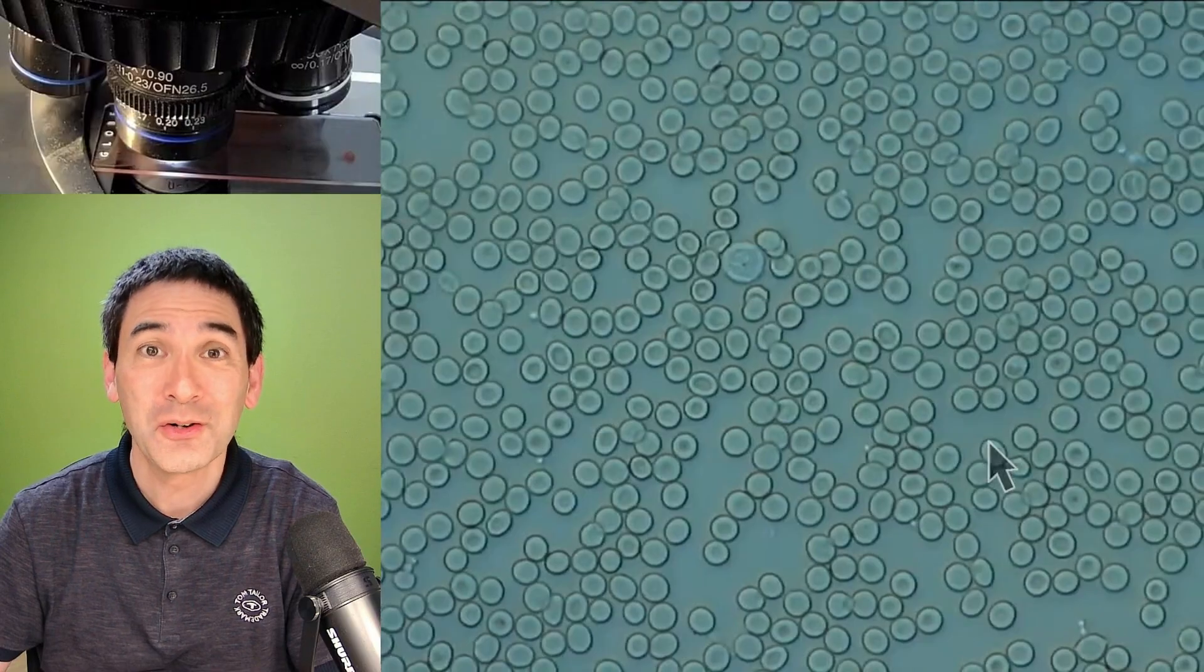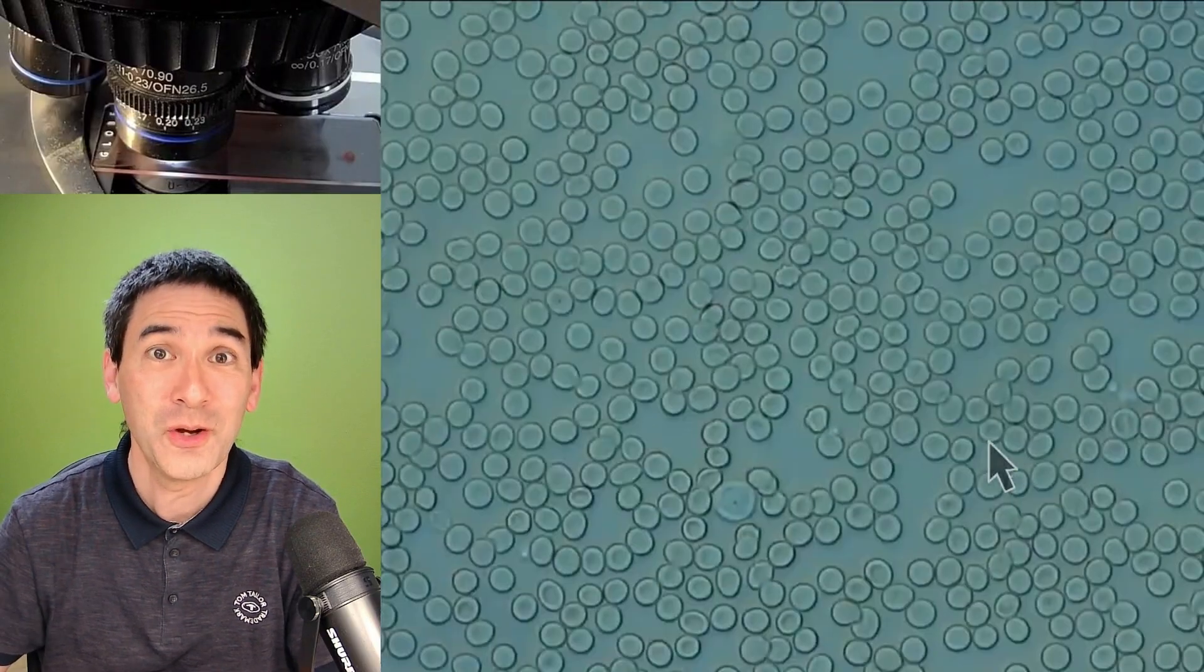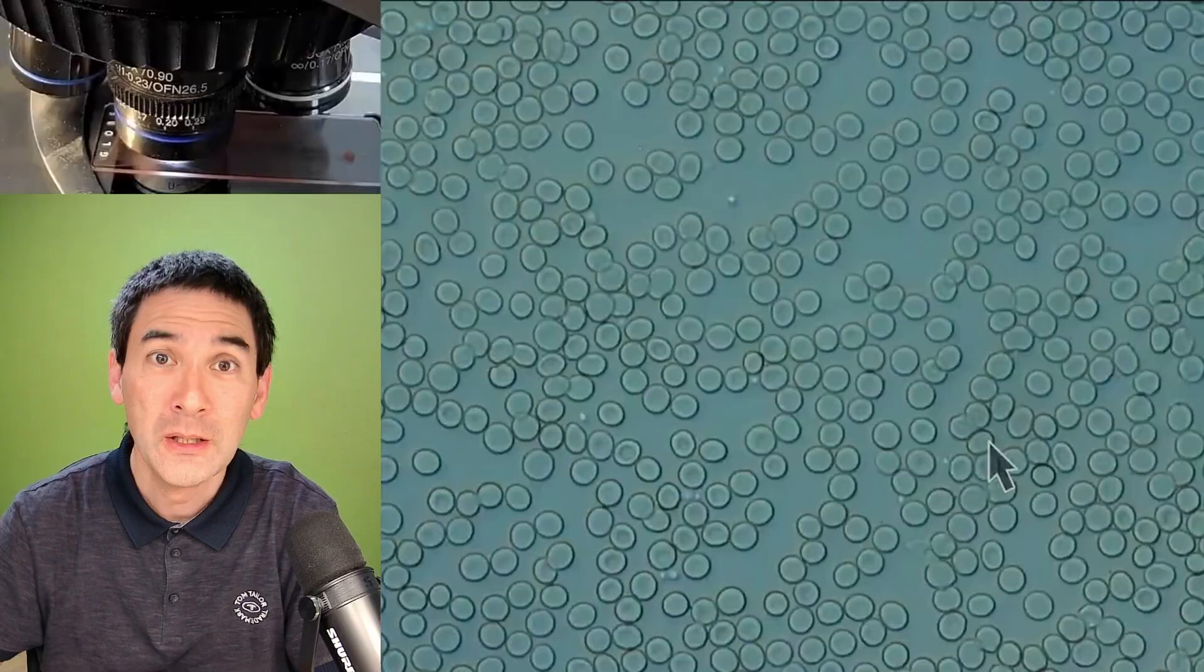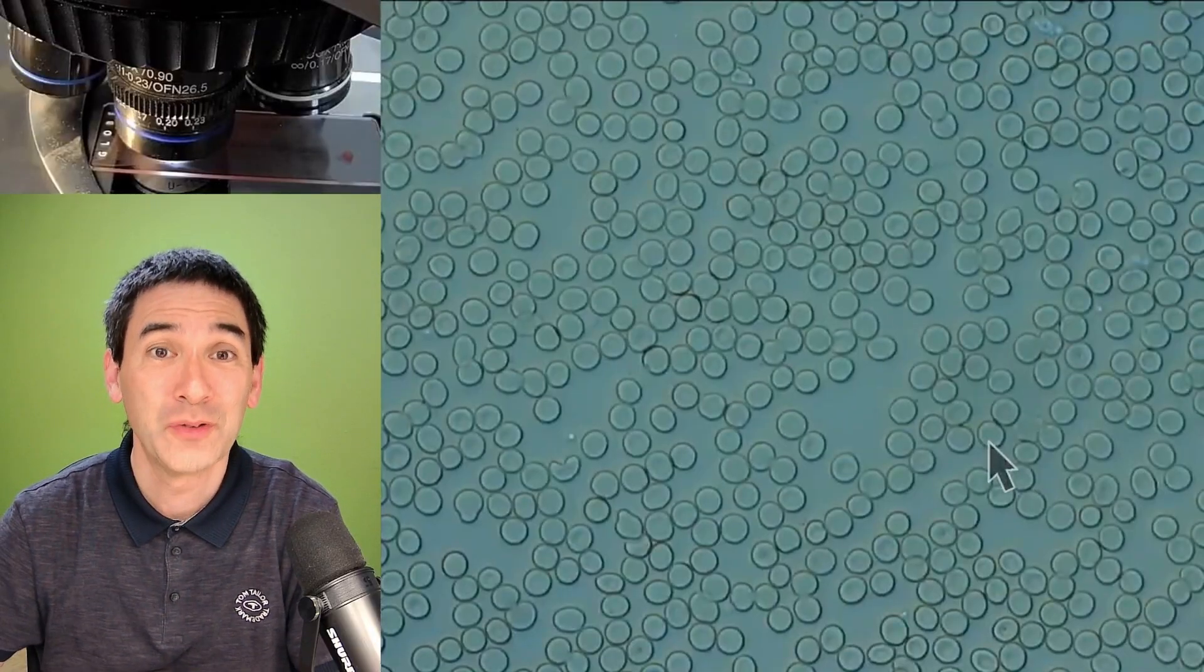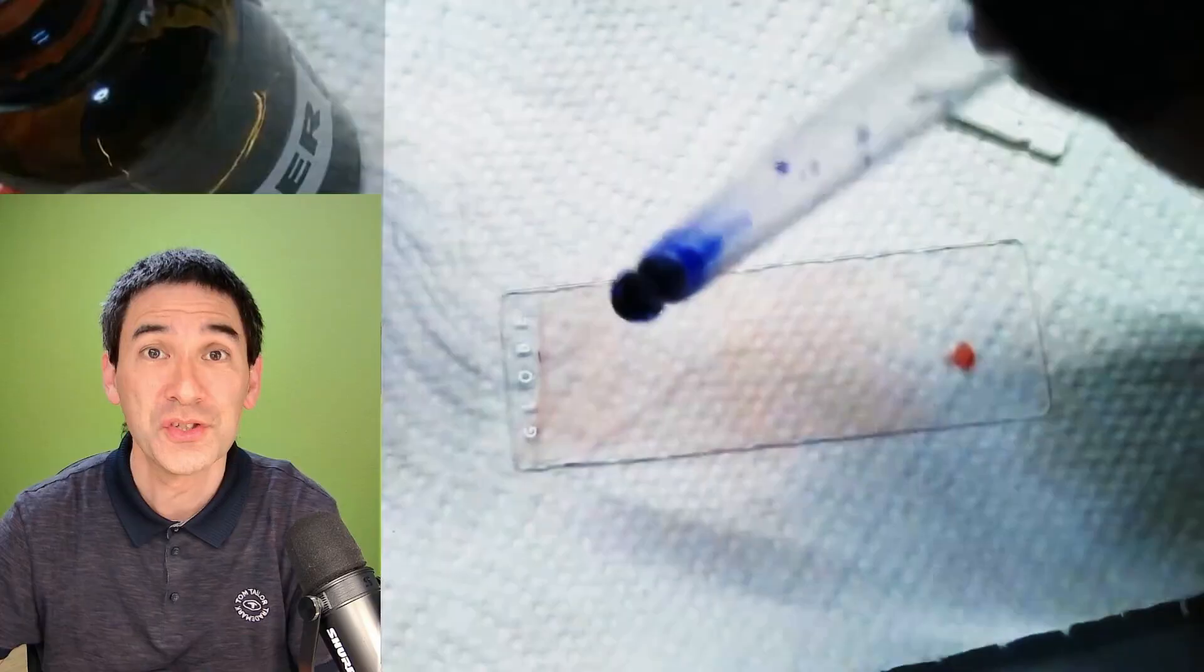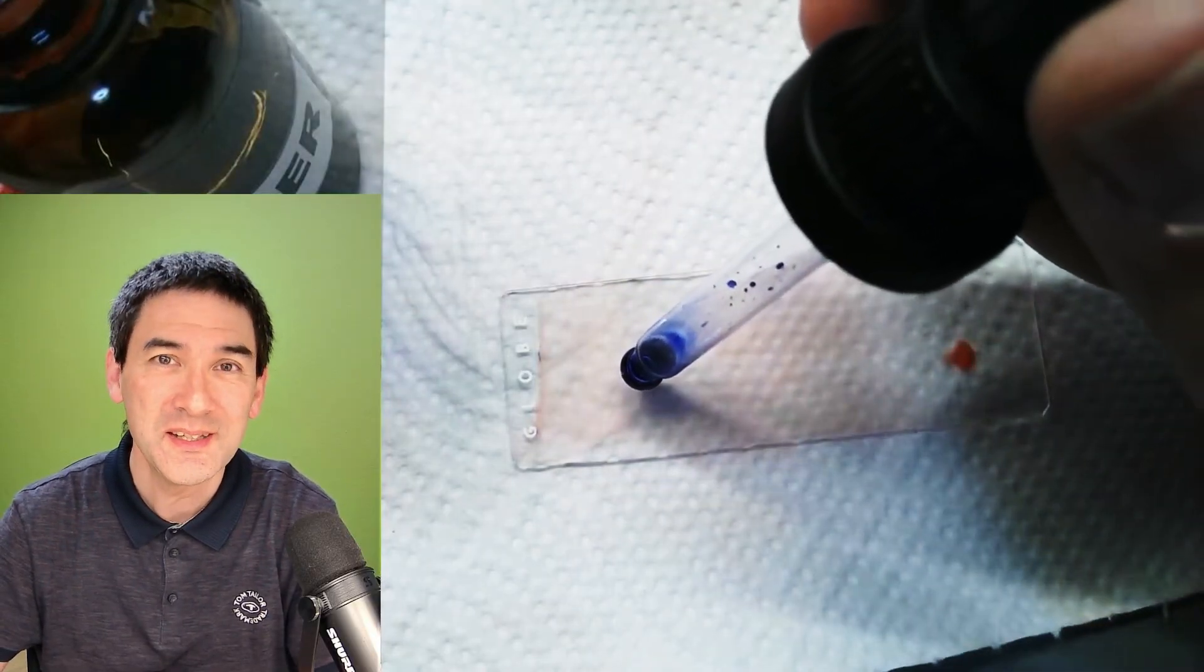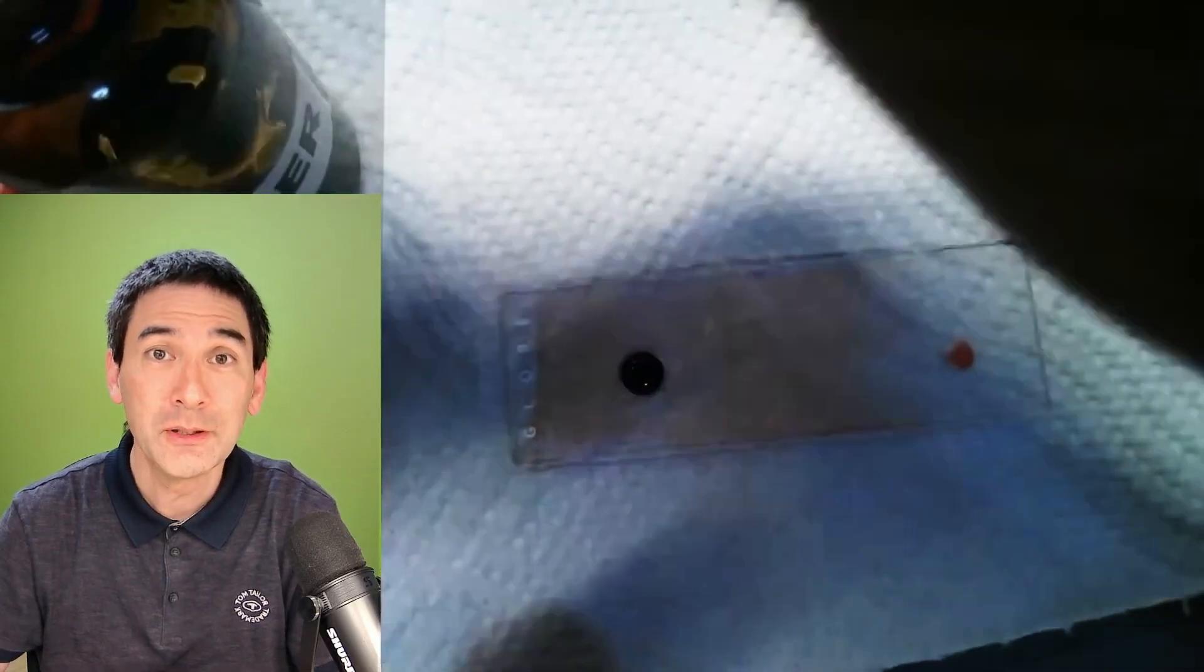The red blood cells are flat on the glass surface and they are now basically from a top view. They're not moving, of course, the reason is because the blood already has dried and you can see that there is also some space between the blood cells so this means that the density is just right. I'm now doing a little bit of staining.